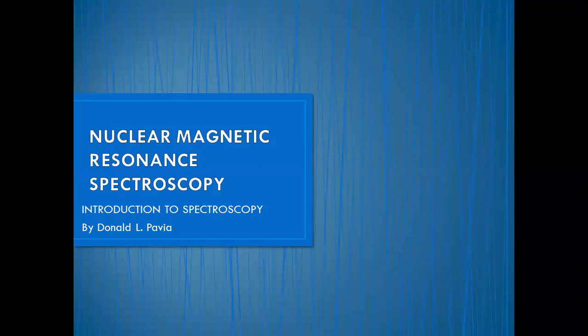And the topic of my presentation is the chemical effect, shielding, instrumentation, and the applications of nuclear magnetic resonance spectroscopy. So, first of all, let me start our presentation with the introduction.